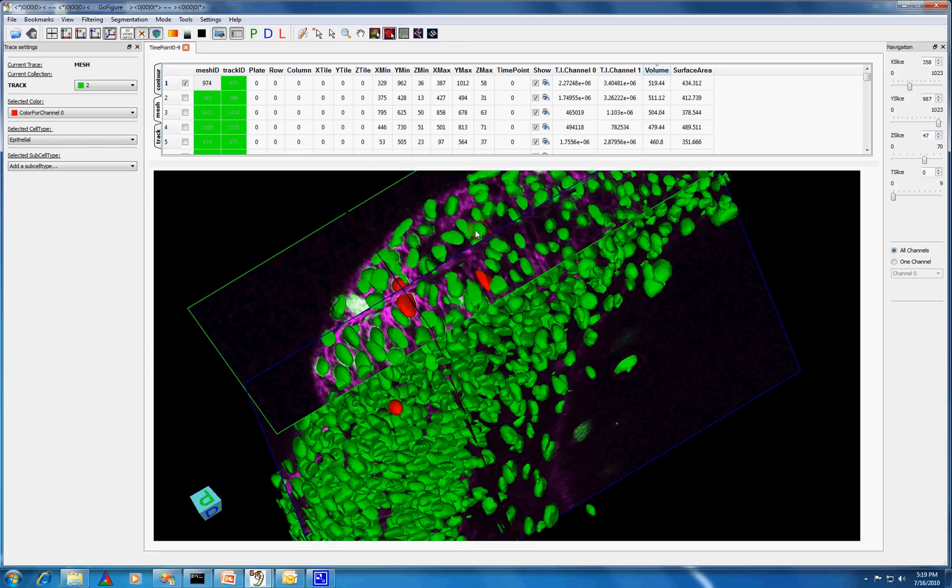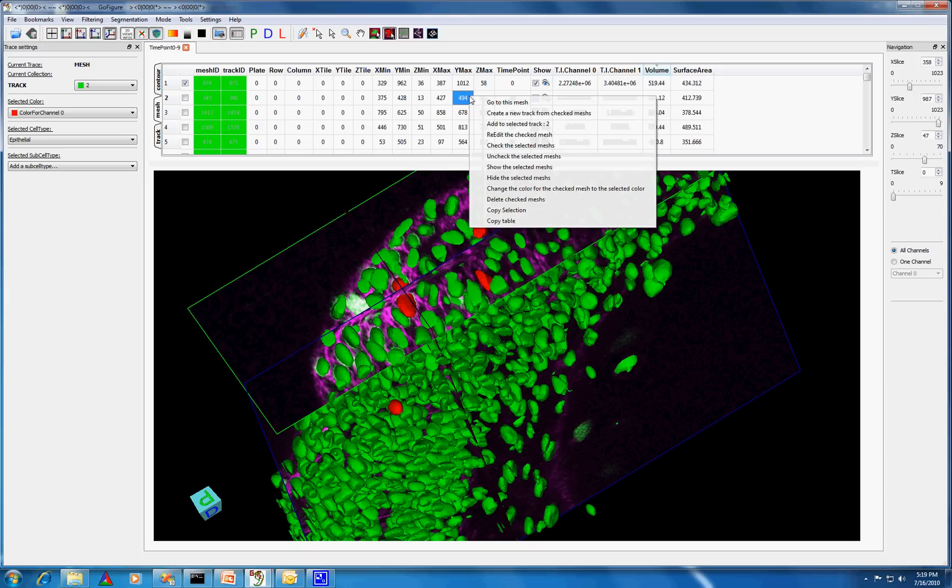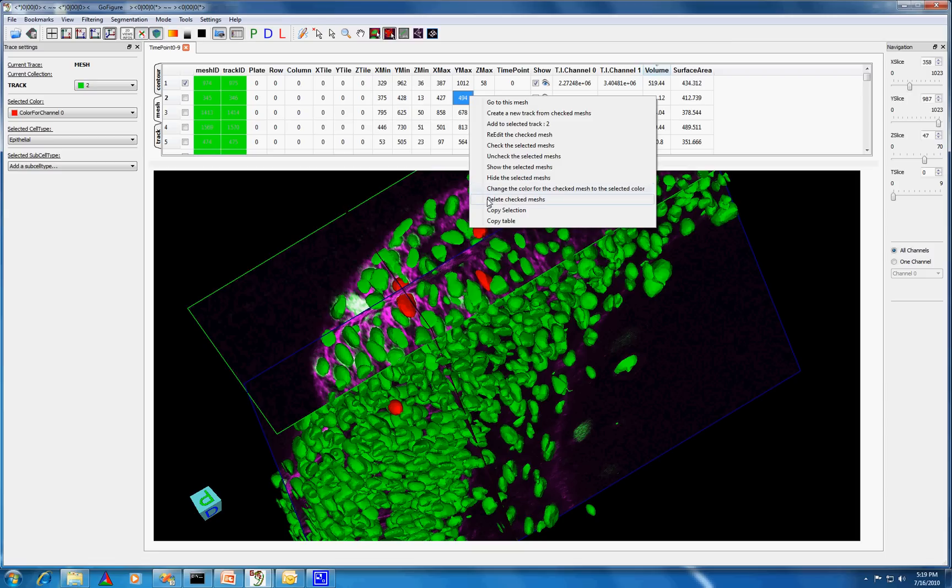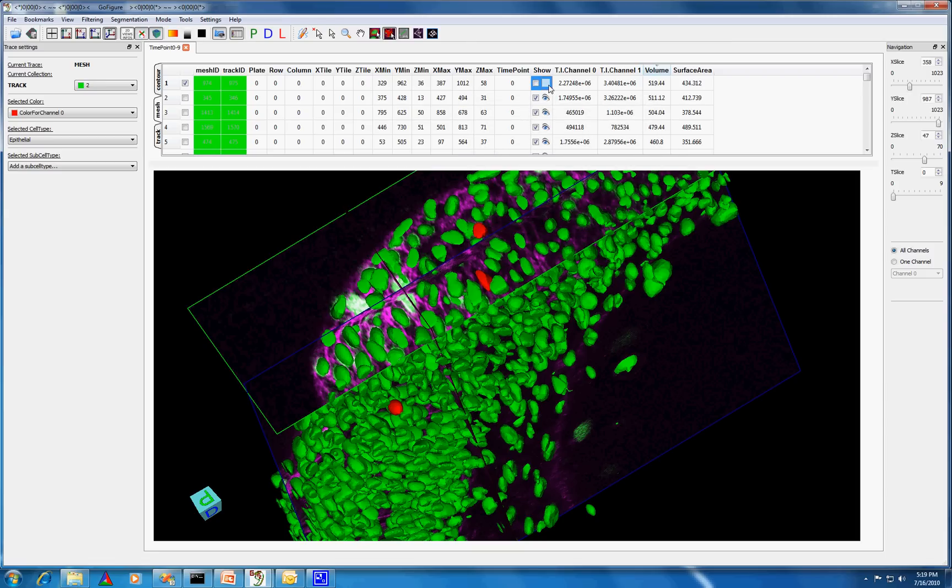Once you've done this, you're able to perform a number of operations on the meshes you have selected. For example, you could change the color of the highlighted meshes, delete the meshes, or choose for every mesh in the table whether you want it to be displayed or hidden.